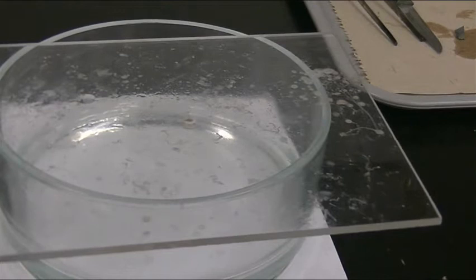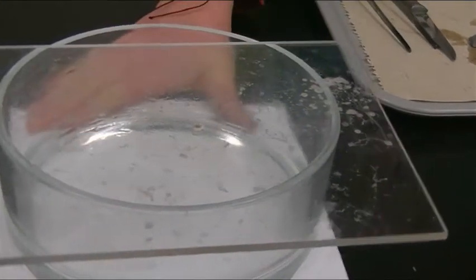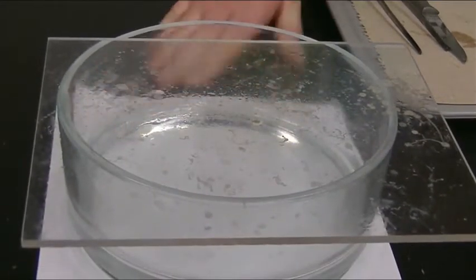We didn't like. Oh, I had it. Oh, there we go. Right. Nice. Try it again. All right. Let's get it straight up, and then we won't move it because I don't want to lose it in the middle of the feed.